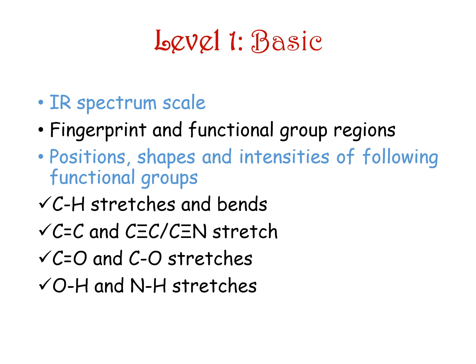So if you regularly revise the contents given in this video or just repeatedly see it consecutively for 15 days, you'll be able to develop a basic confidence in interpreting the IR spectra. Because we are directly switching on the spectra, it is advised that you should read the theory from the books to understand from where this spectra originates.